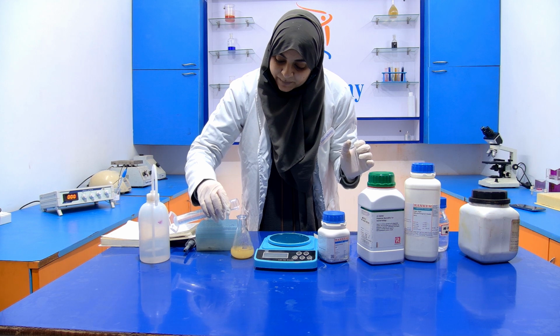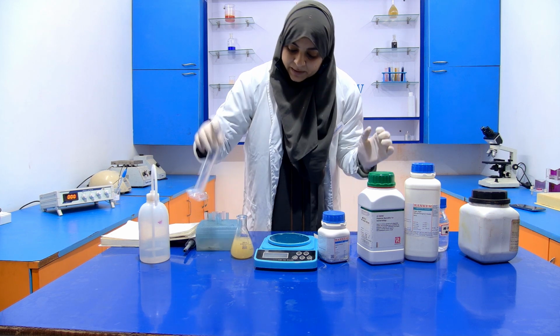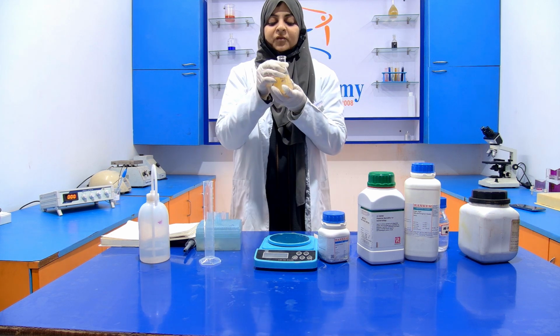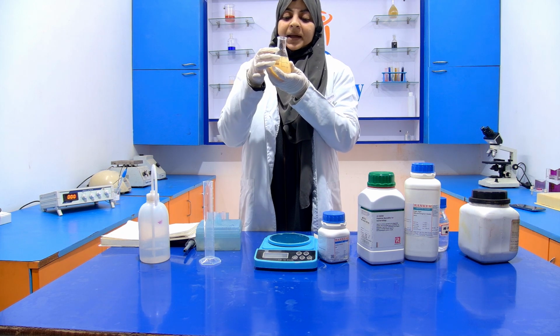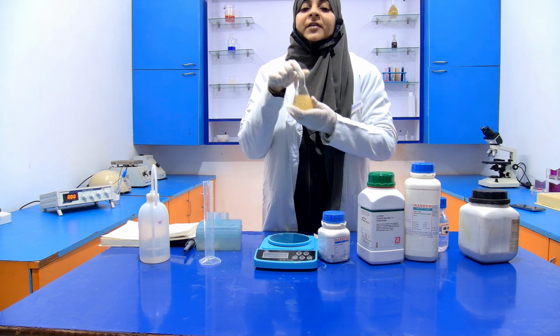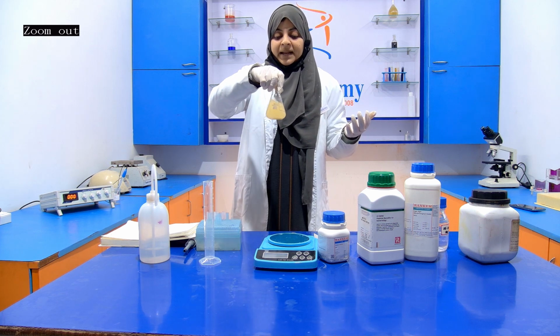Now this 50 ml of distilled water is again added into the media. One thing that we have to take care of is that we don't prepare the media up to this level. We have to prepare it only till this line so that when we autoclave it, it will not be contaminated.